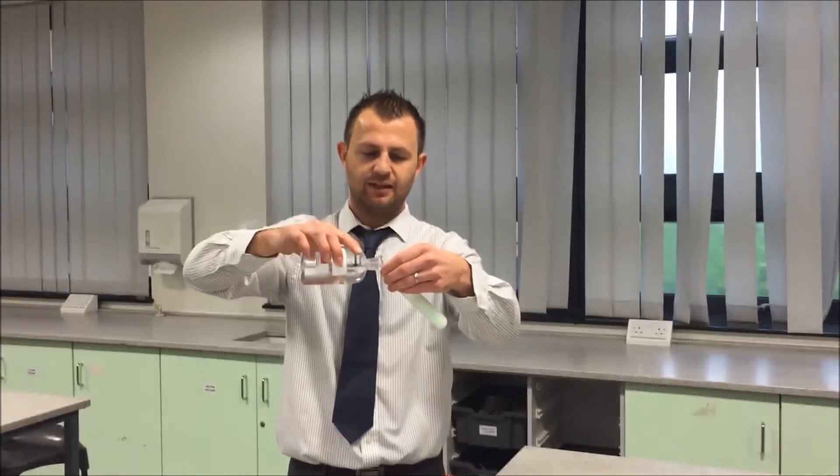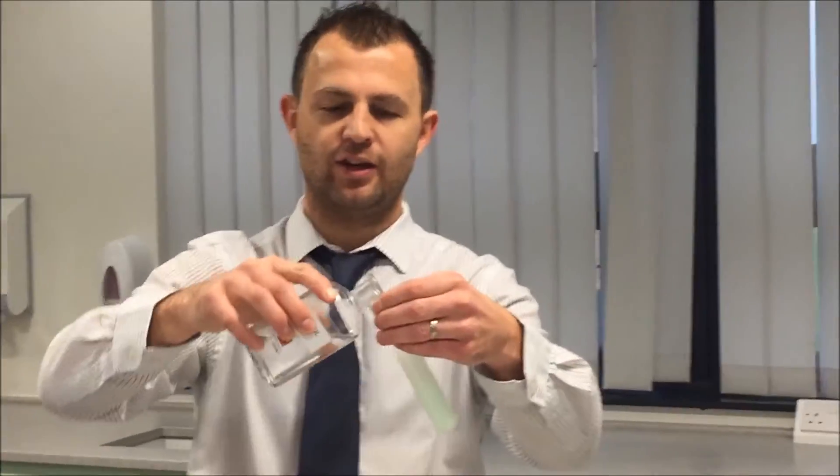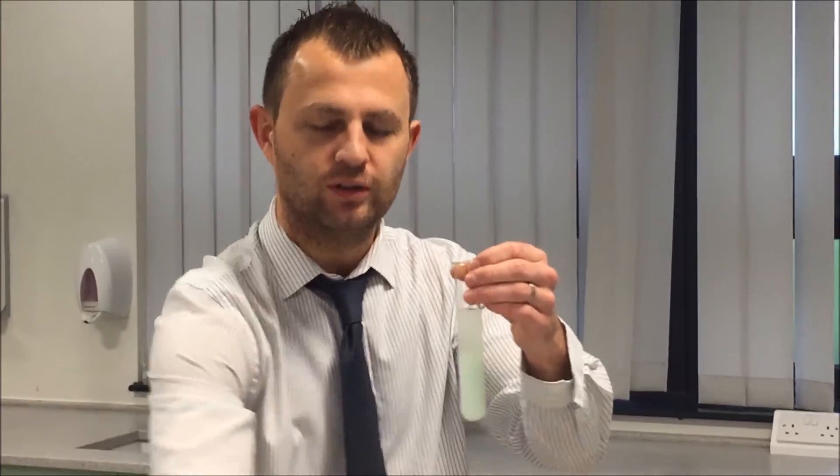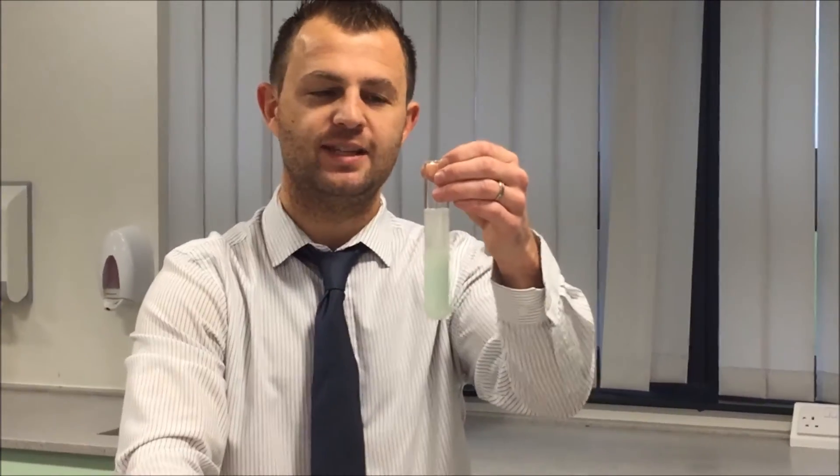This is because DNA is insoluble in ethanol and will come out as white strings, almost like cotton wool. That's how to extract DNA from a banana.